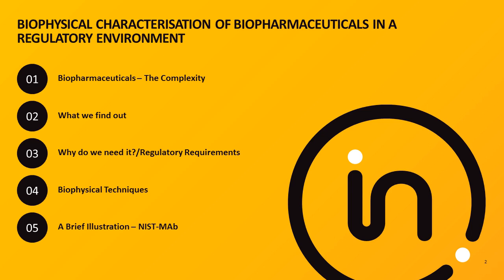I've structured the talk into 5 different sections. Section 1 deals with the complexity of biopharmaceuticals. In section 2, we're going to figure out what we are looking for, what we need to find out. The next section would be the need for all of these biophysical characterization studies. Then section 4 would be based on biophysical techniques, the techniques that are available. And I'd end with brief data that I have generated on the NIST monoclonal antibody.